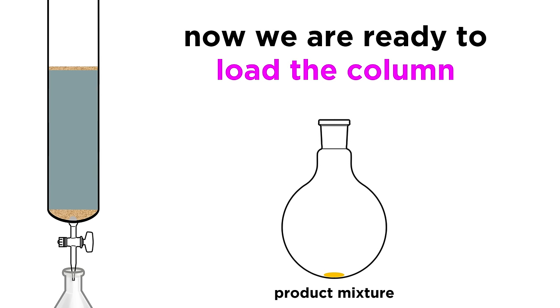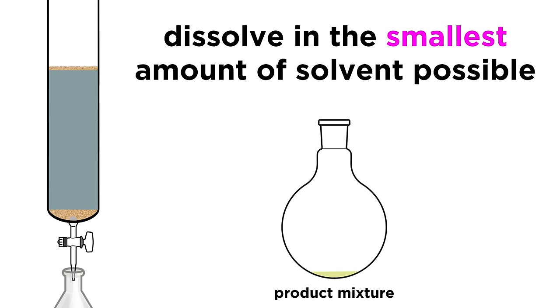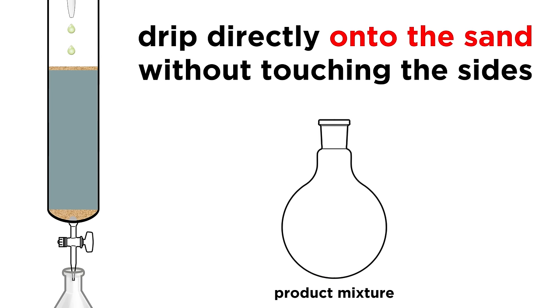Now we are ready to load the column. We take our isolated mixture, and we dissolve it in the absolute smallest amount of solvent possible that will enable us to pipette it onto the column, just a few drops if possible. While getting it in there, try not to get any of it on the sides of the column, we really want it to drip down directly onto the sand.